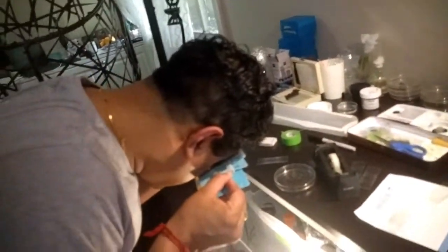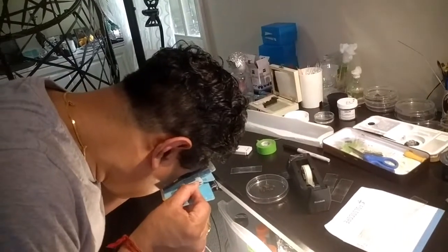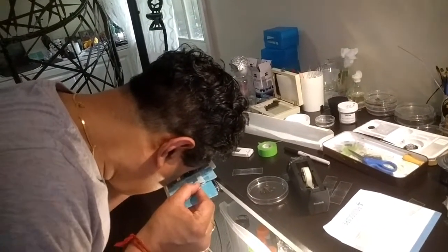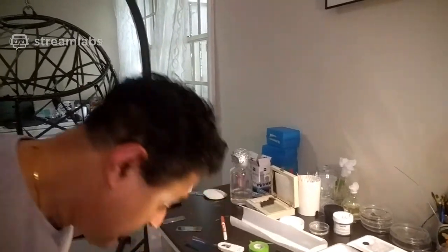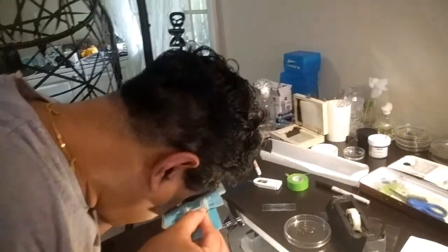And of course, the tardigrade. Okay, now let's try to see if we can find them here. The thing about tardigrades, some of them are even resistant to ionizing radiation.